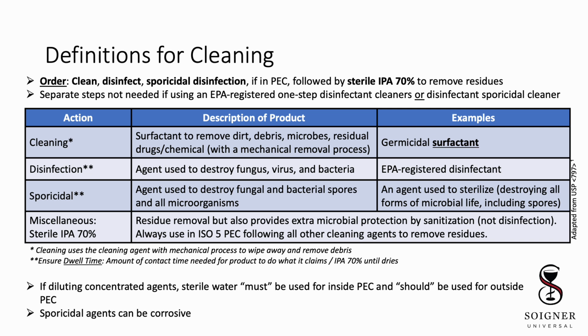Now, for the disinfection process, with or without sporicidal activity, we have to introduce an important concept called dwell time. The dwell time is the amount of time that a surface must remain wet in order for a product to do its stated claim. The dwell time for any given product will be found within the manufacturer's information.